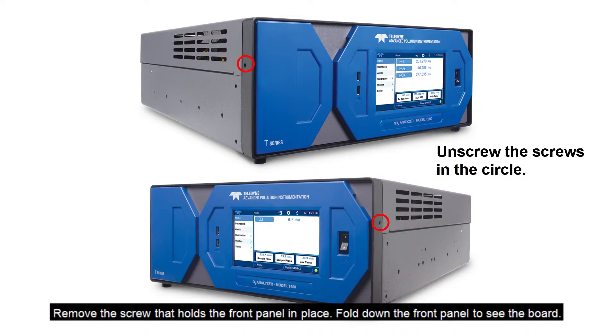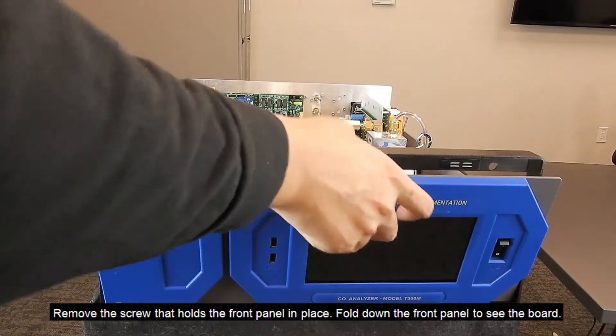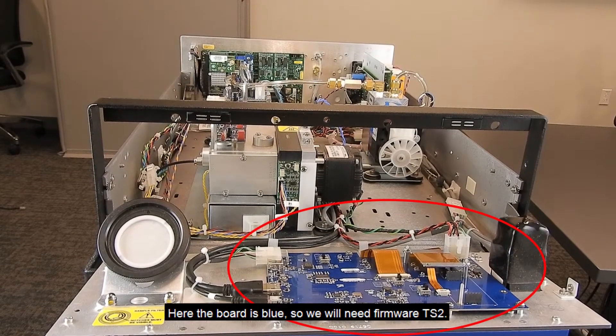Remove the screw that holds the front panel in place and fold down the front panel to see the board. Here the board is blue, so we will need firmware TS2.